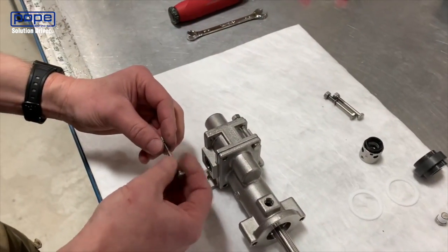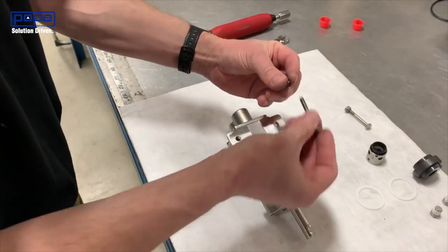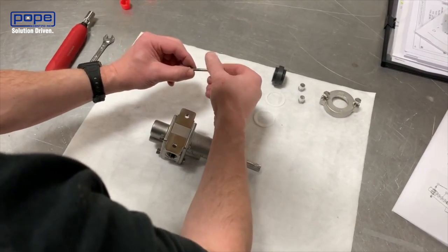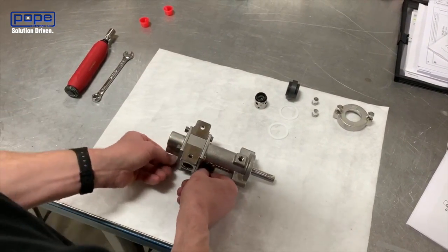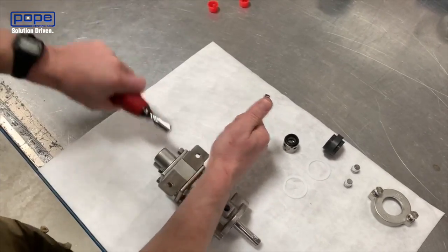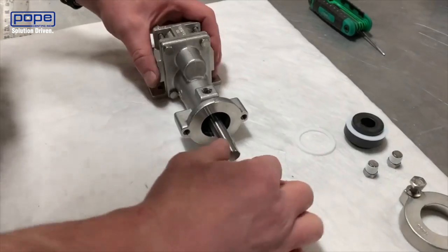Tighten those hand tight and get all four in. Once they're hand tight, take a wrench — you're going to use a 3/8 wrench — and tighten those up, going one by one around the pump. Now we've got the housing bolts tightened down. Do another quick check that the shaft rotates freely.